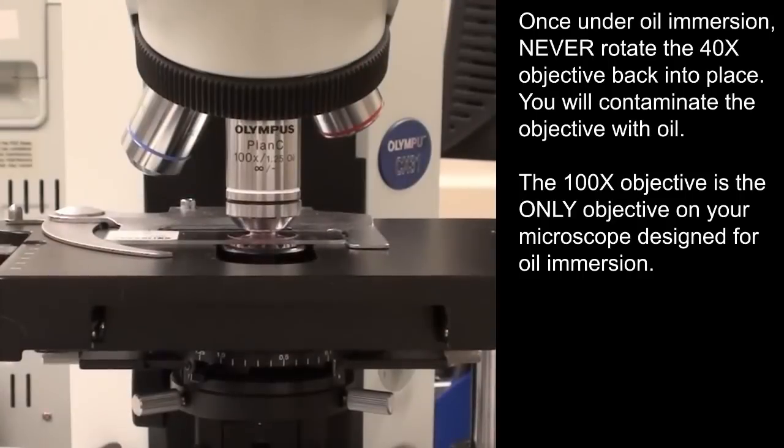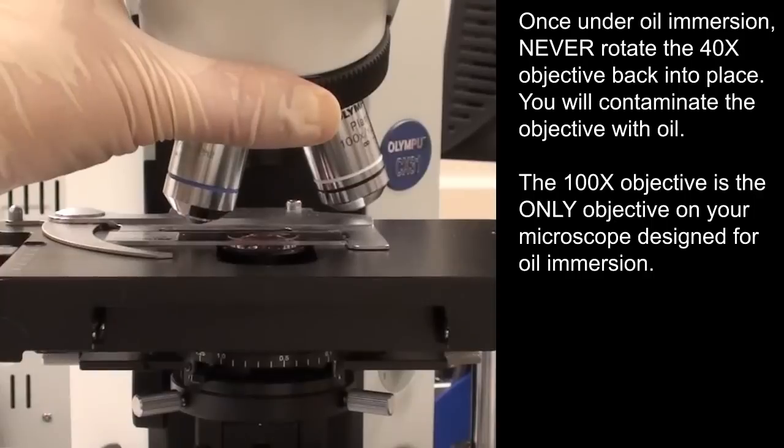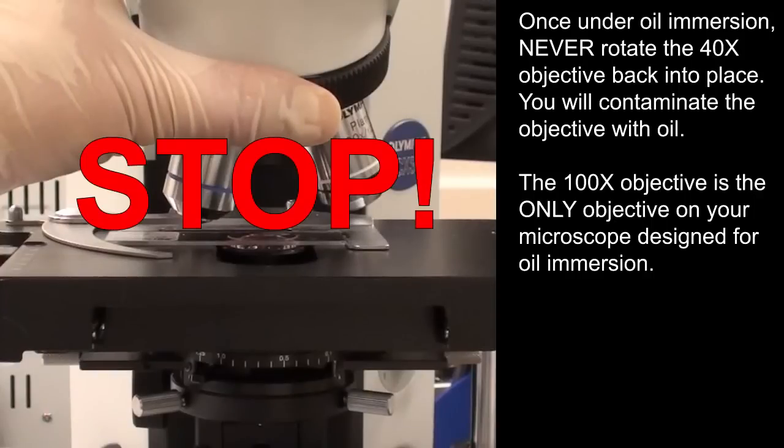Once under oil immersion, never rotate the 40x objective back into place. You will contaminate the 40x objective with oil. The 100x objective is the only objective on your microscope designed for oil immersion.